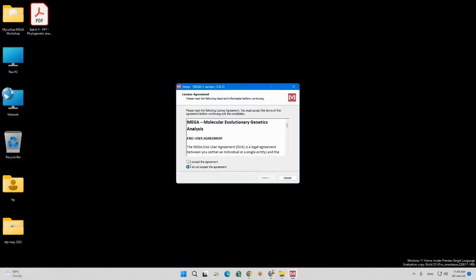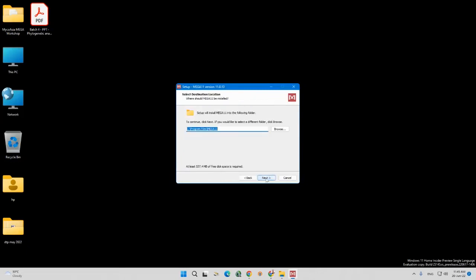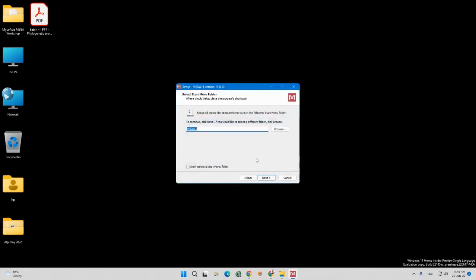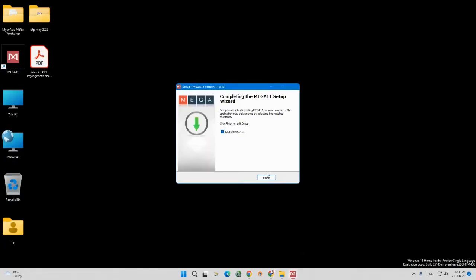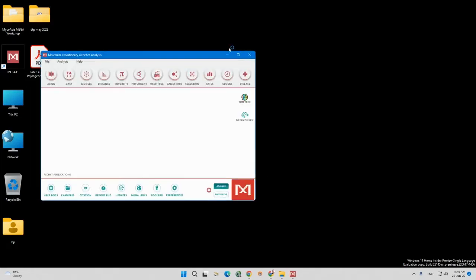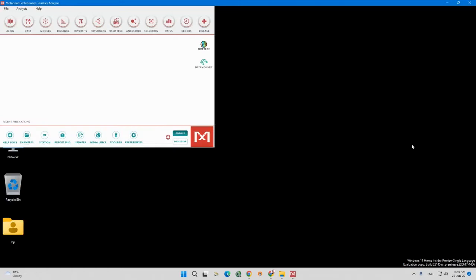I accept the agreement and I say next. Okay. Finish. So here is your MEGA software.